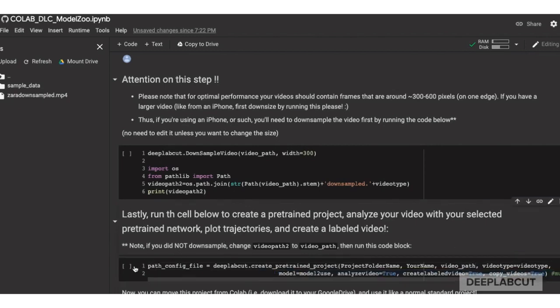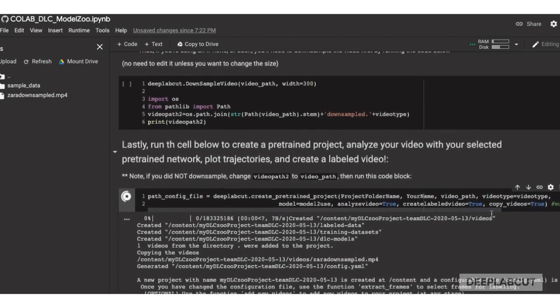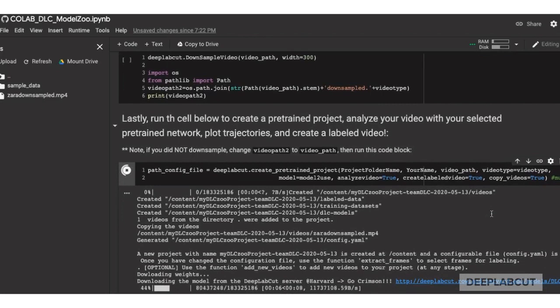Then, follow the instructions, update the video path if necessary, run this cell, and you'll see that the model is beginning to download from our Harvard server.